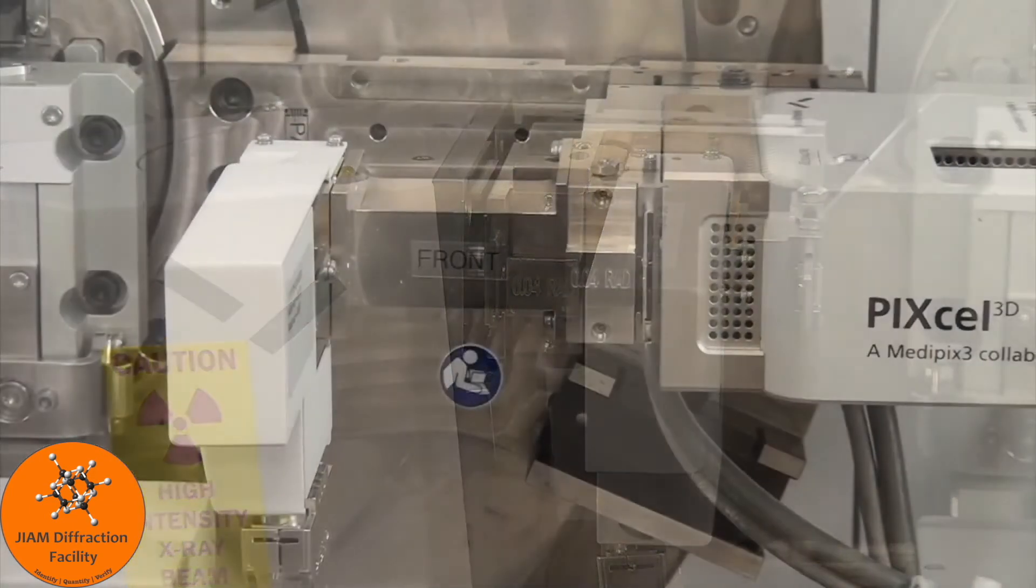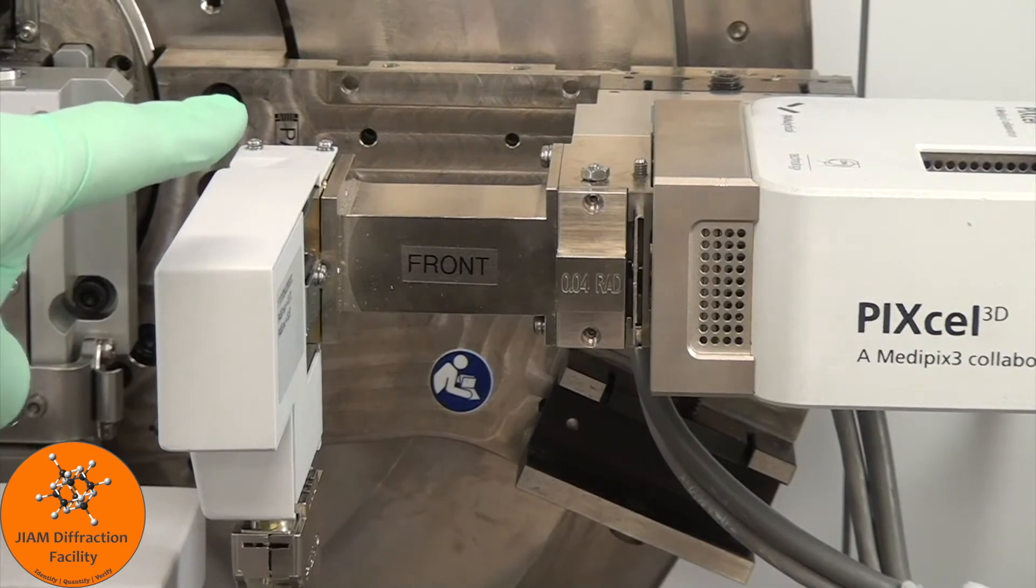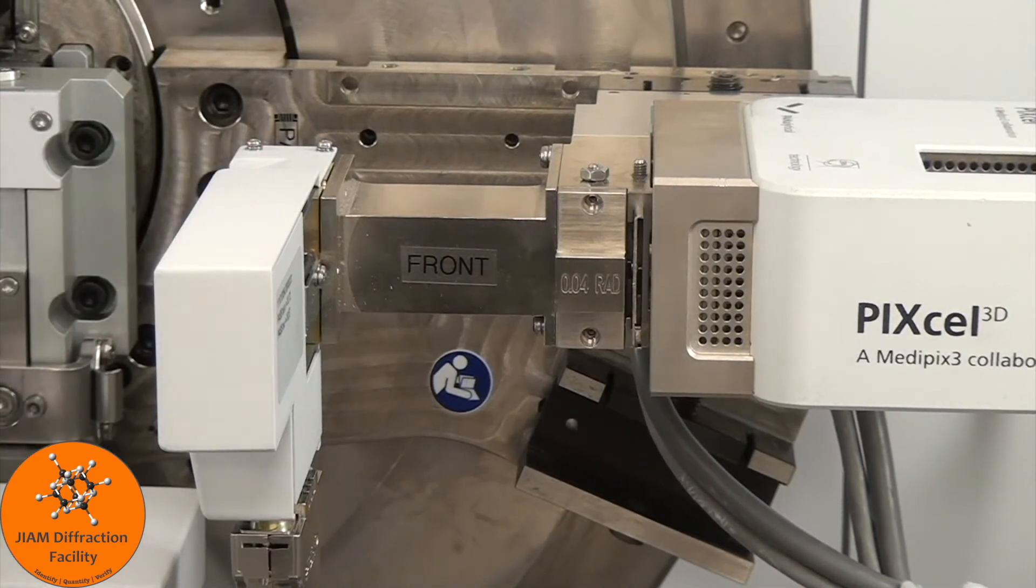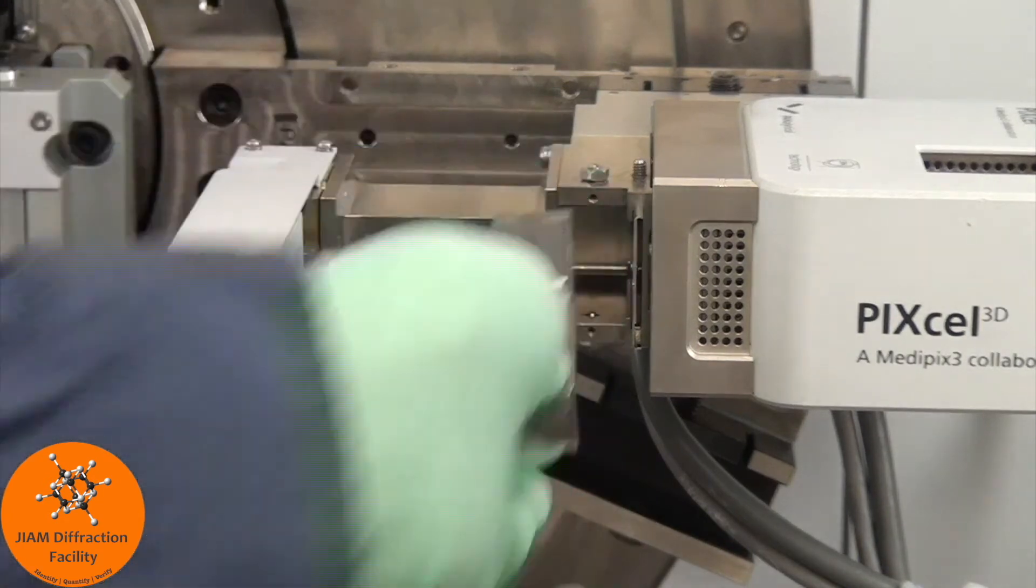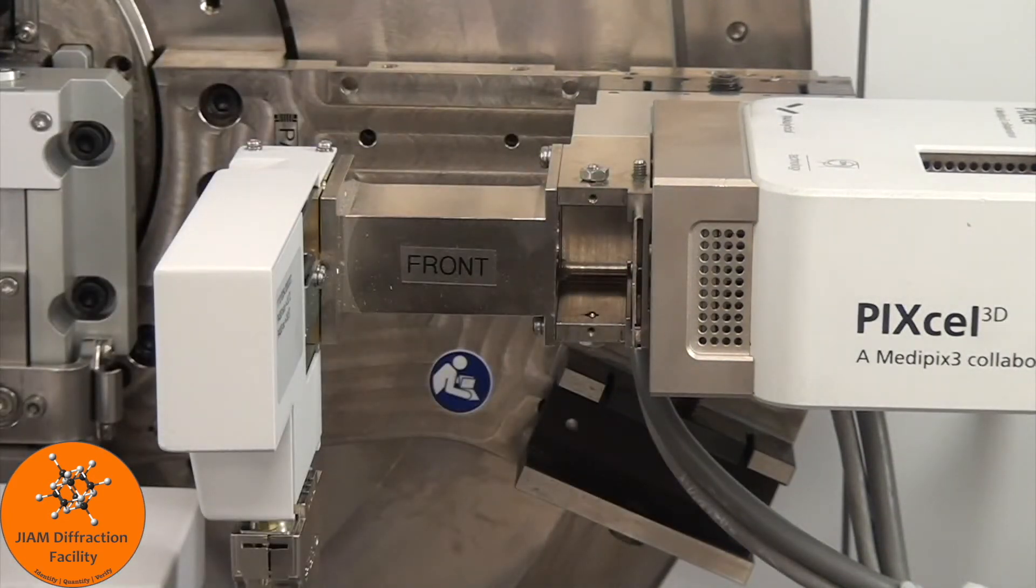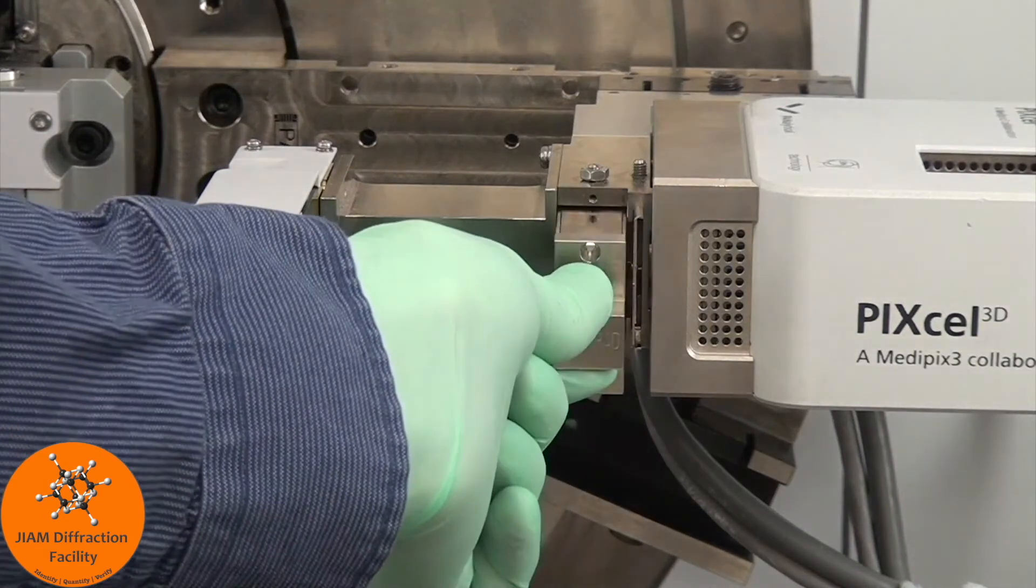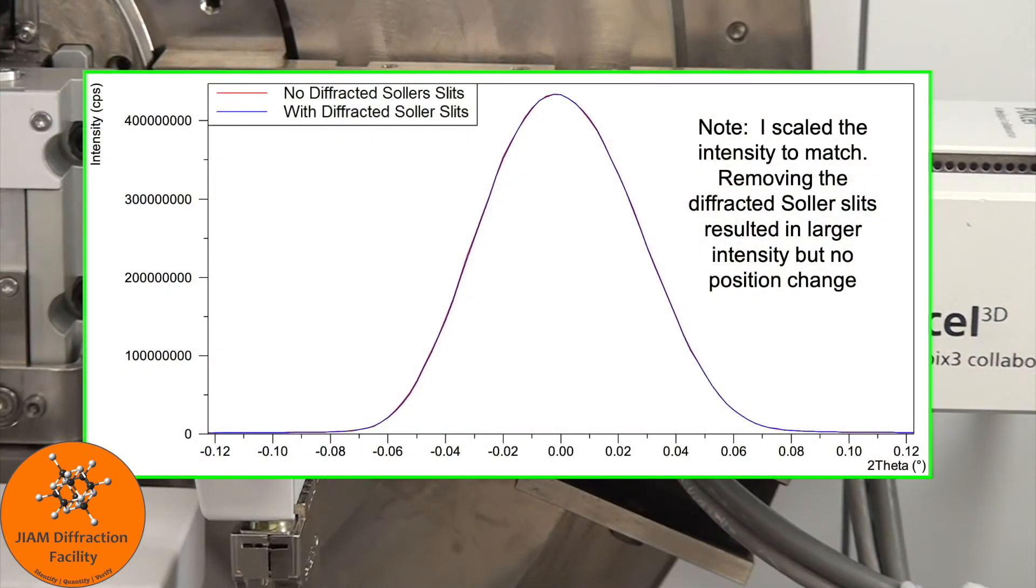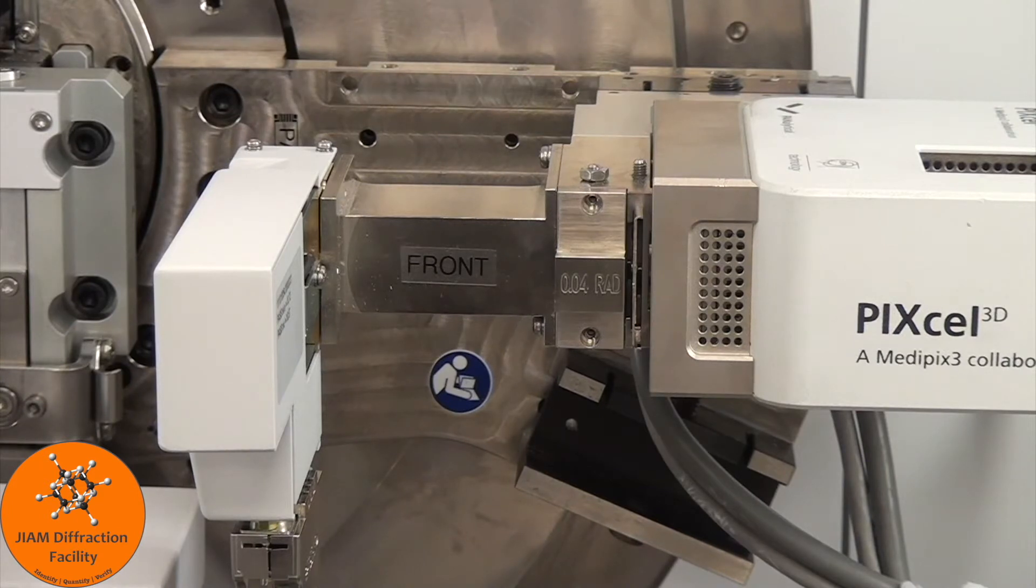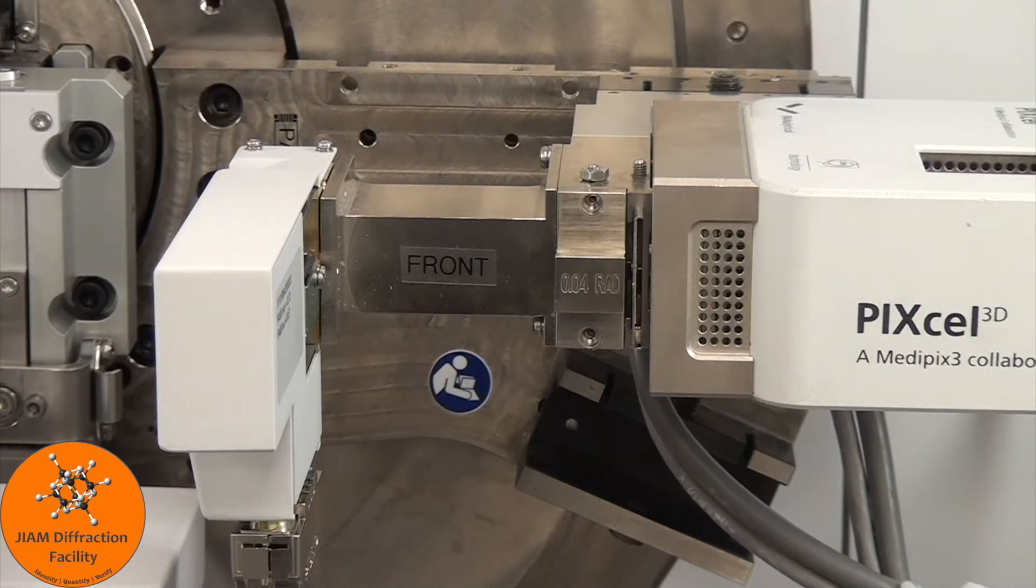For the diffracted beam side, and for alignment, we want the programmable anti-scatter slit to be as open as possible, so we will use the computer to set it to be 4 degrees. The recommendation I received from Panalytical is to remove the large solar slit on the diffracted beam side. Honestly, I have tried it both ways, with and without the solar slit, and I don't really see any difference. You should see somewhere on your screen right now a comparison of two patterns that I collected with and without these solar slits. Officially, you should probably remove it, but I'm just going to leave them in there as that is one less thing I have to worry about remembering to put back in. Other than that, there isn't really anything physically that you need to change on the diffracted beam side.